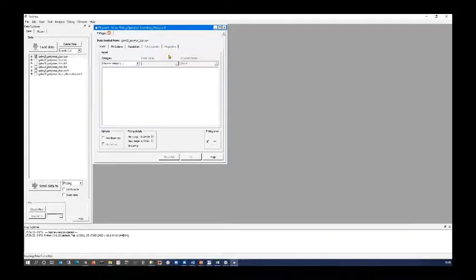Now, this particular sample is a partially deuterated polystyrene blend. And if anyone from Oak Ridge is listening, it actually has some history here because it was given to us by none other than George Wignall, GDW being George's initials, of course. But we still use it now and again. So it's a polymer dispersed in itself, if you like. So that's as good a solvency condition as you can have, and so we would expect this to exhibit Gaussian chain statistics, and so the scattering from that is described by the Debye Gaussian coil.